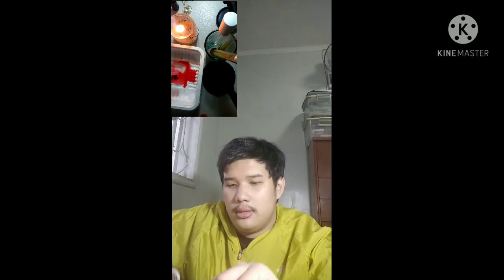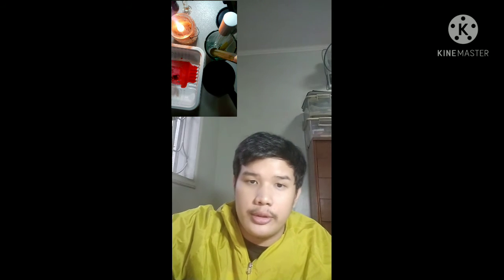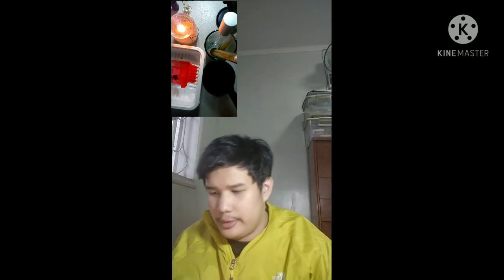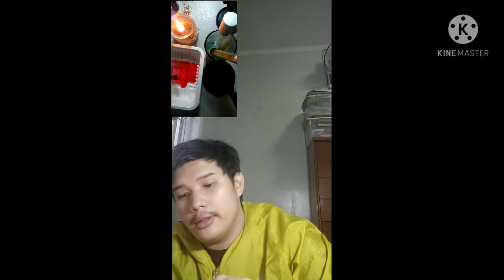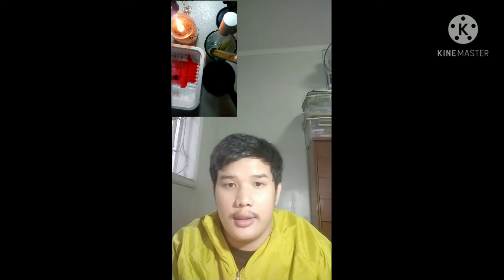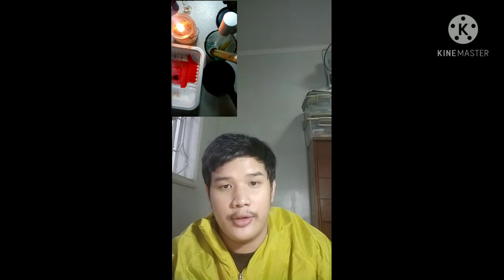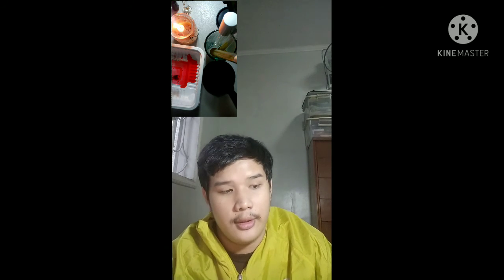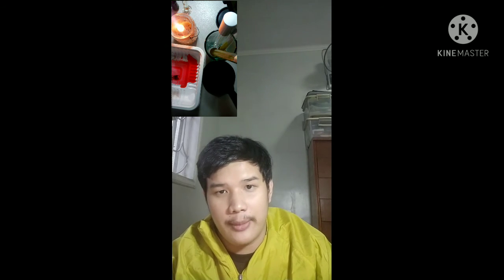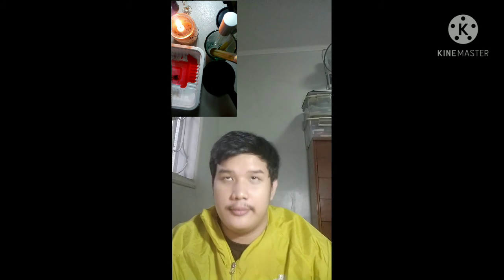Sunog. Do make sure to not let your glass slides heat so much, because from our previous video, the glassware video, we learned that glass slides are made out of soda lime glass that is not that resistant to heat.